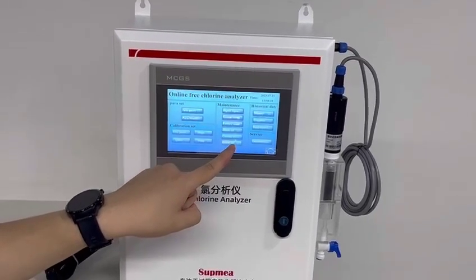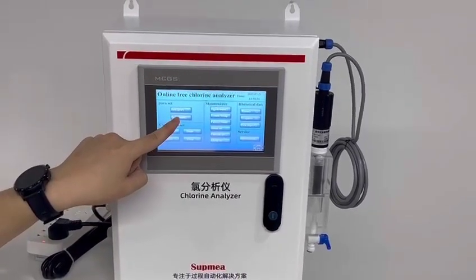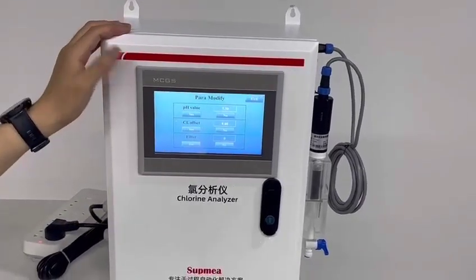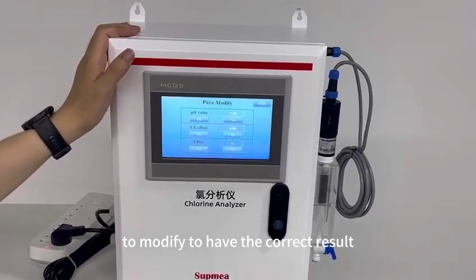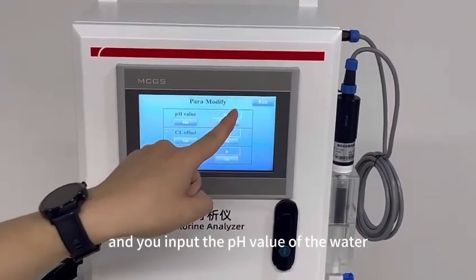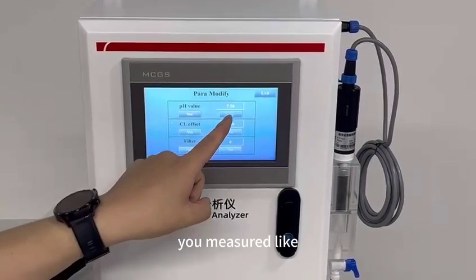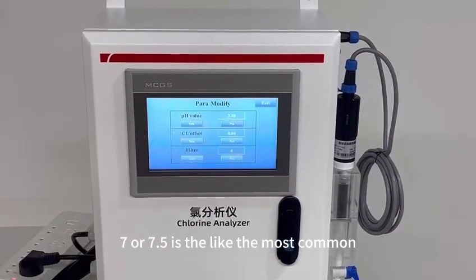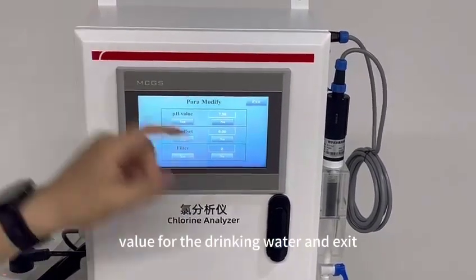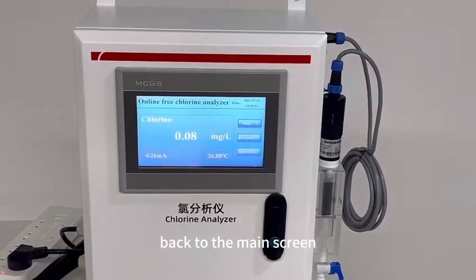Log in, and then click Modify. These are the parameters we need to modify to get the correct result. The very important one is the pH value. Input the pH value of the water you are measuring — like 7 or 7.5, which is the most common value for drinking water. Then exit and go back to the main screen.